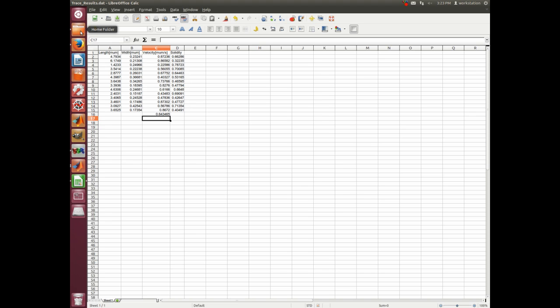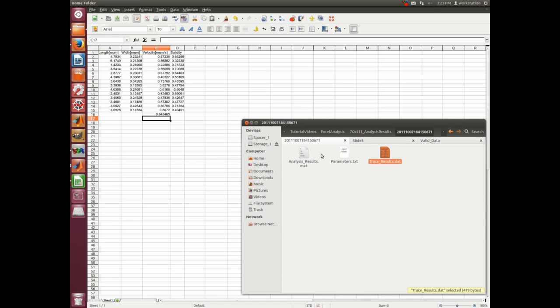As I would go back here, you can see that there is not just the trace results for this very video from this flow cell, but we actually have the results from all 8. So you can go into the second one, you see there's another trace results, and we can basically go through the same maneuver as before and calculate the sliding velocities for each and every one of them. So far, that I think is the general idea of how this works.